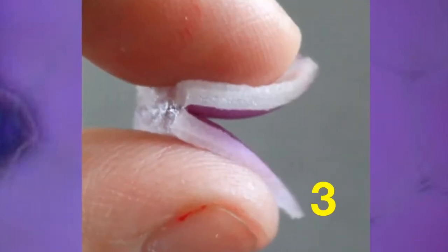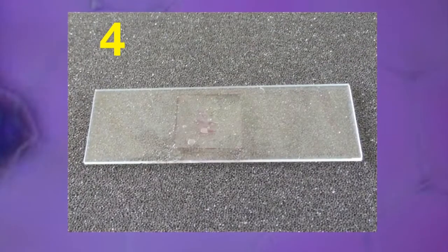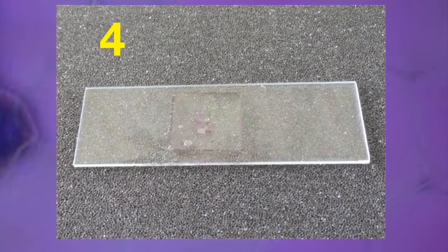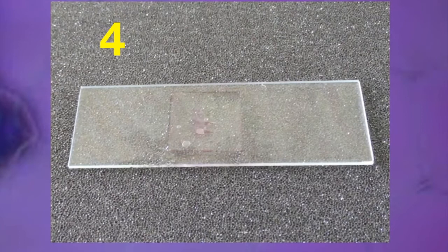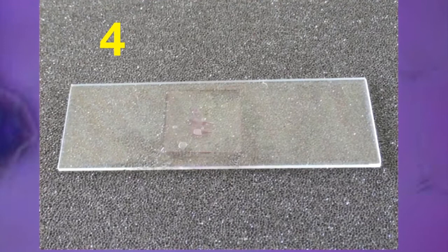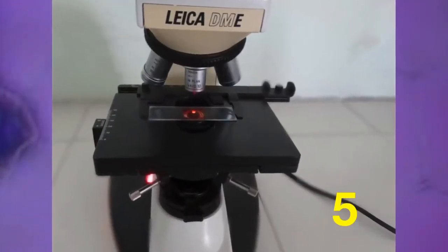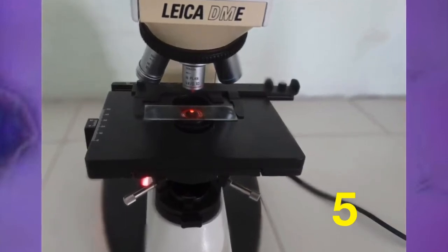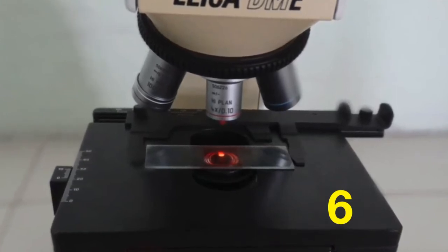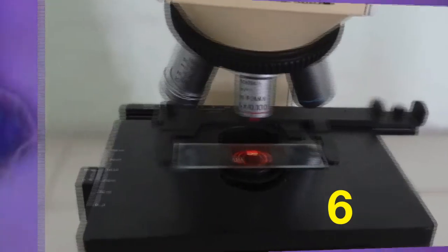Now cut the thin red film into small pieces. Take a strip of the onion cells with the help of a brush and place it on a microscopic slide with 1 or 2 drops of distilled water and cover the drop of water containing the onion strips with a cover slip. Keep the slide under the 10x objective of a microscope and observe the cells. Now shift the objective of the microscope to 40x and observe the cells. Examine if the cells are intact or not.